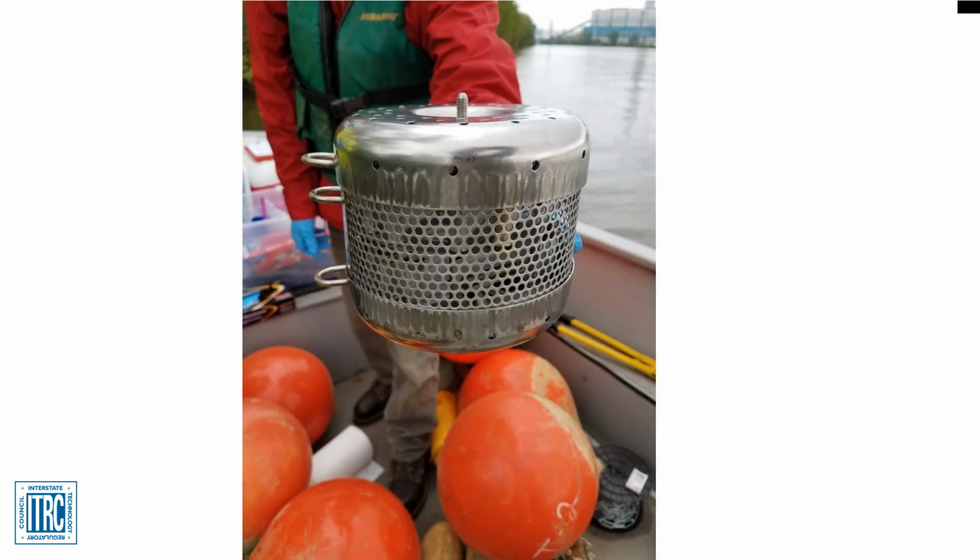When deploying the SPMD, it should be secured at the desired location in the water column. This can be achieved using a few different methods, depending on the site and target media, such as tying the device to a fixed point on the shore, hanging the device in open water, or suspending at the bottom with anchors and floats. Important things to consider when deploying the device.